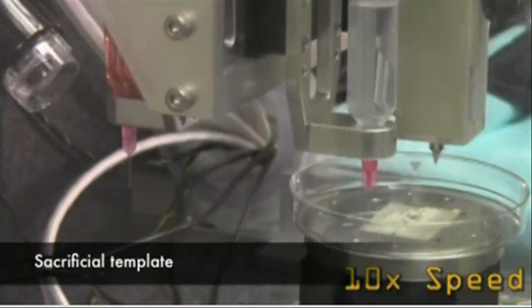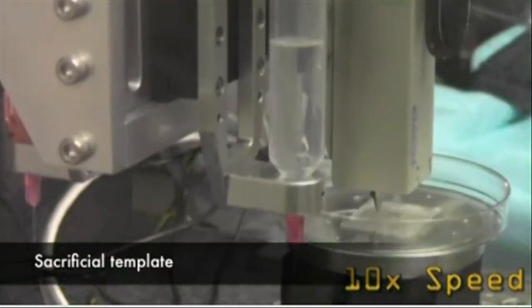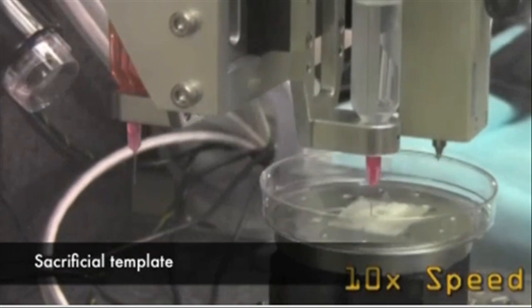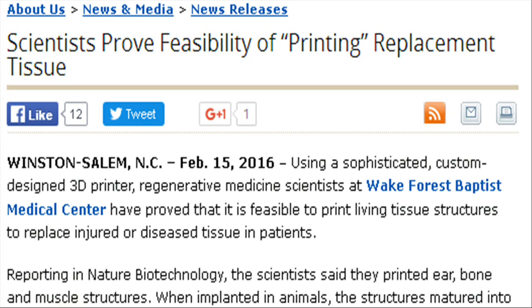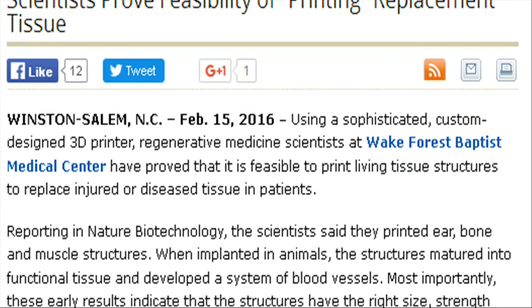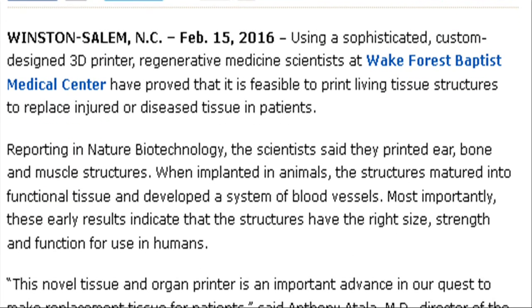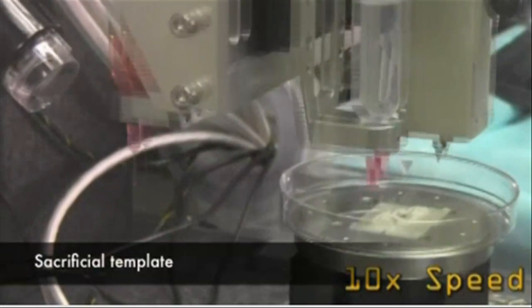Using a sophisticated, custom-designed 3D printer, regenerative medicine scientists at Wake Forest Baptist Medical Center have proved that it is feasible to print living tissue structures to replace injured or diseased tissue in patients.